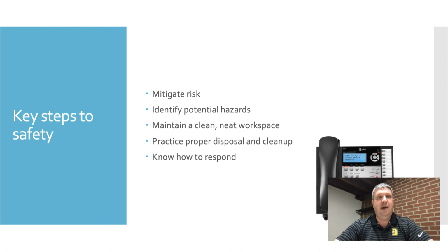We should know that in our lab, we have the wall phones, and really this goes for any place in the building. If you have a friend that gets hurt or something gets spilled, you can pick up any school phone, press the top button on the phone, which is labeled office chain, and that will automatically ring all of the people on our emergency response team that will know how to put things into action that will help take care of your emergency.